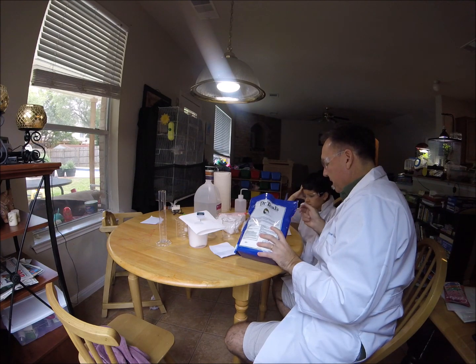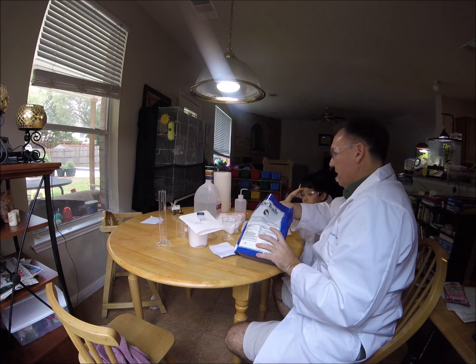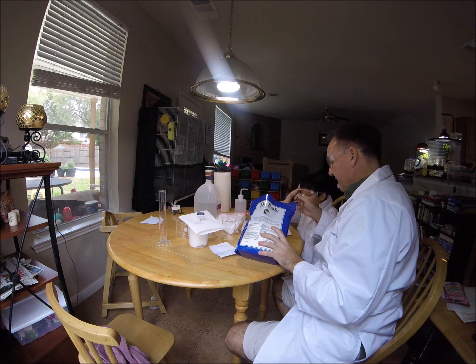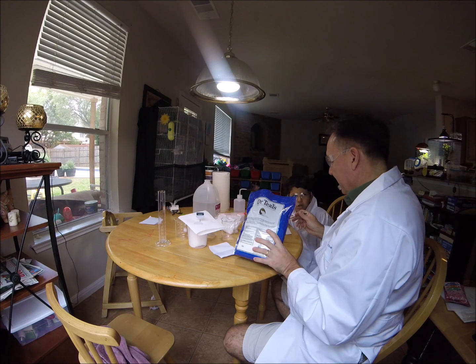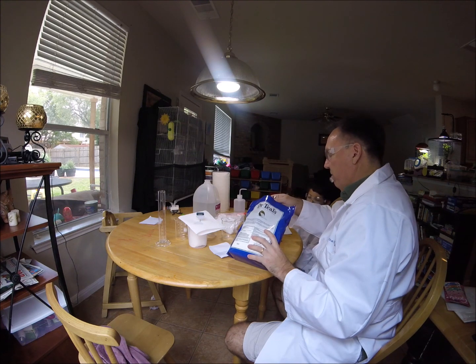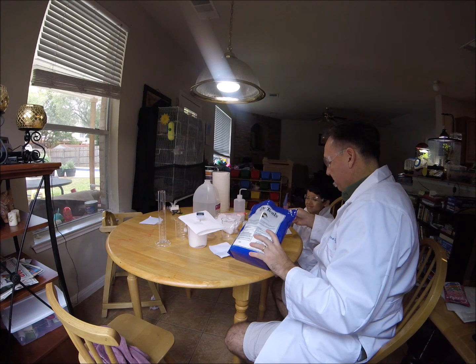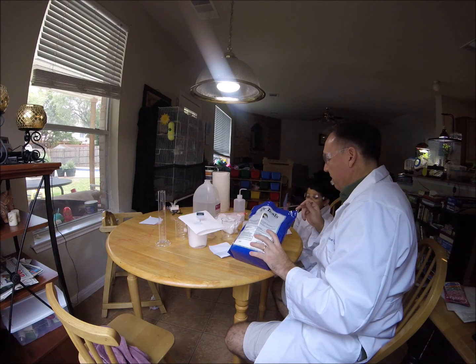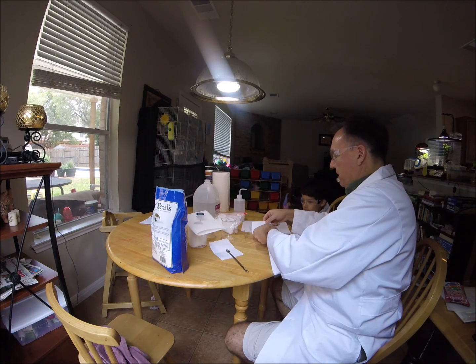5.7 grams of magnesium sulfate, coming up. We got a long way to go. I'm using the biggest one at the table. 3.507... 4.3... 5.3... a little bit more... 5.4... 5.6... oops, I went over. That's okay. There we go — 5.7. Let's set this aside now.